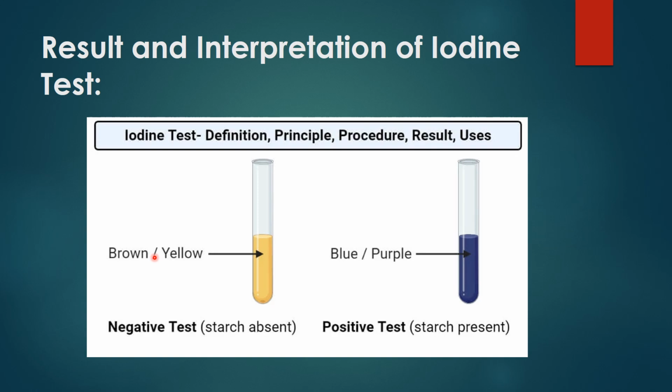So in this situation, because they are detecting for the presence of starch primarily, this will be a negative result. That means the starch is absent in this sample.